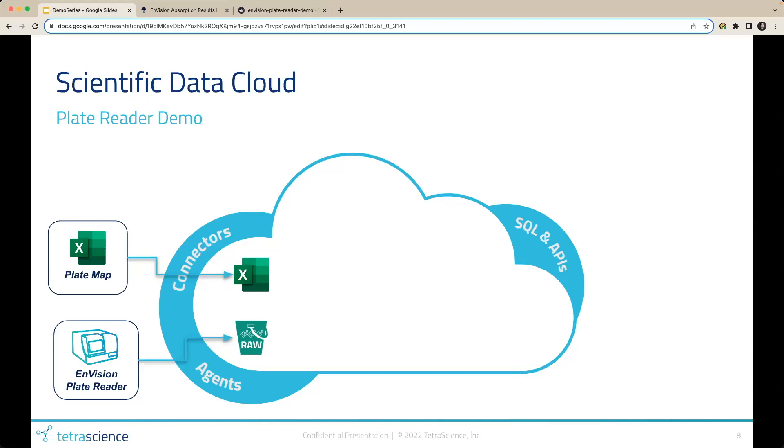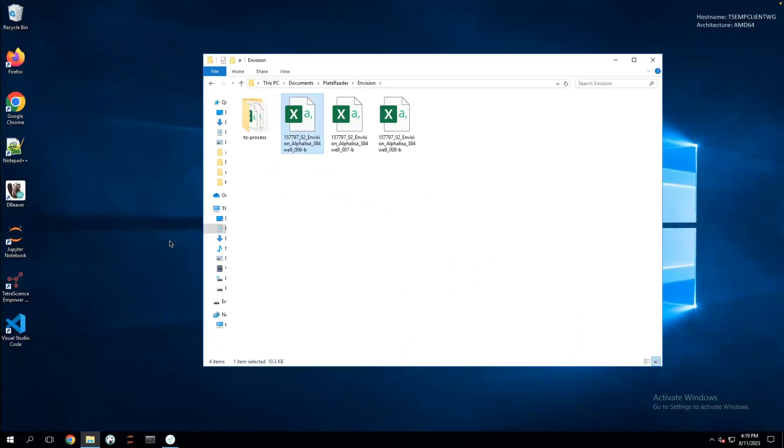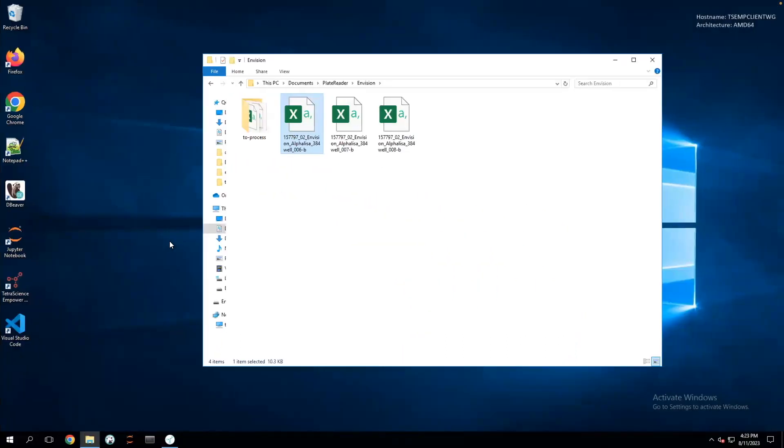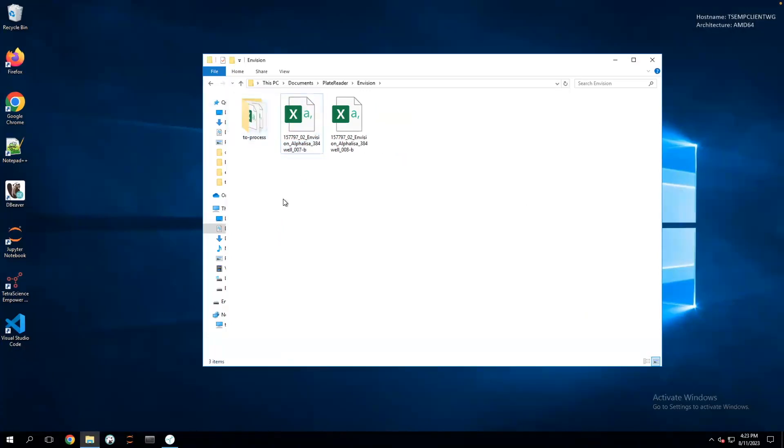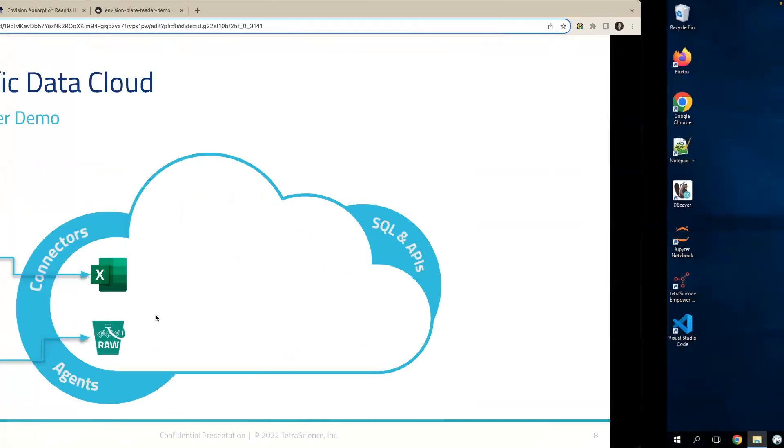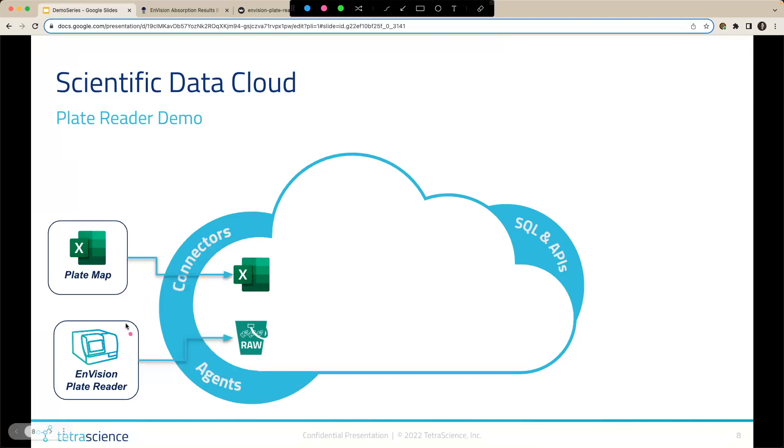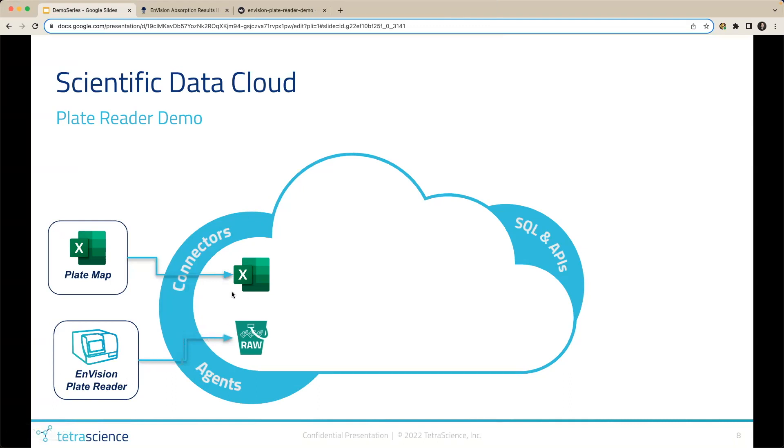For demo purposes, I'm going to manually drag and drop a raw plate reader file into a directory the platform is monitoring. I'll briefly change over to my remote desktop, where the platform is monitoring this to-process folder. I'm going to drag and drop this file ending in 006-b into that folder the platform is monitoring. Now I'll jump back to the presentation. I just simulated this step of the plate reader file being dropped onto the platform. In production environments, this step would be automated. But for the demo today, I wanted to show that.